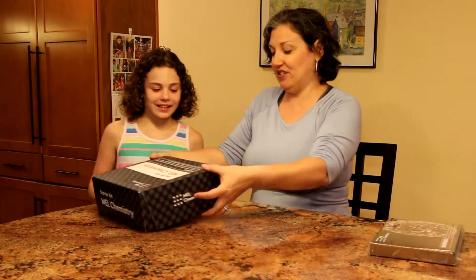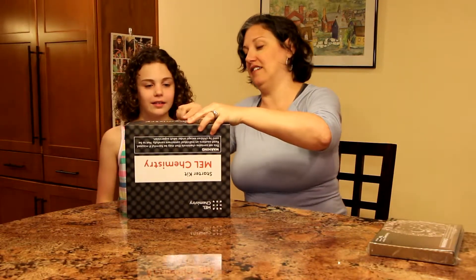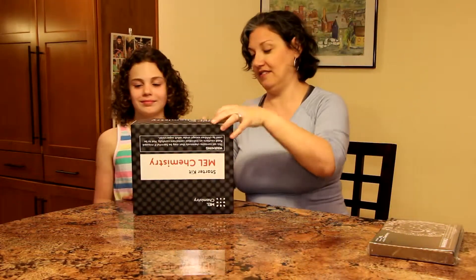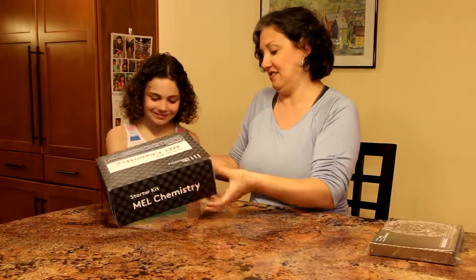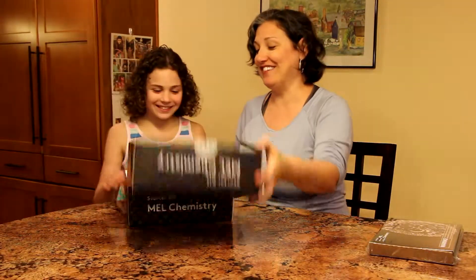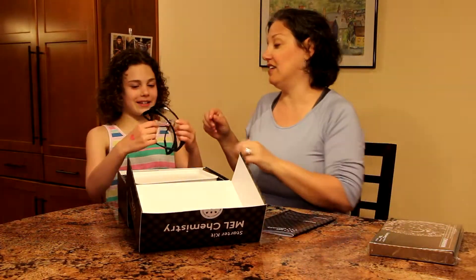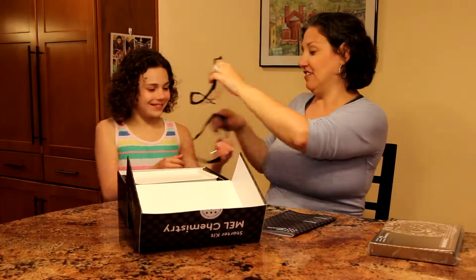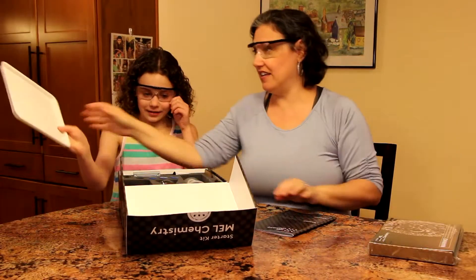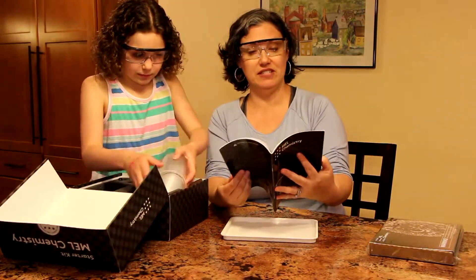Alright, let's take a look in the starter kit. Always let mom and dad use the sharp objects. So what's this? There are two pairs of goggles. How handy. Always wear your safety goggles. No, those are mine! Here's your tray. They give you safety goggles and a tray. This looks like instructions on how to use these things.